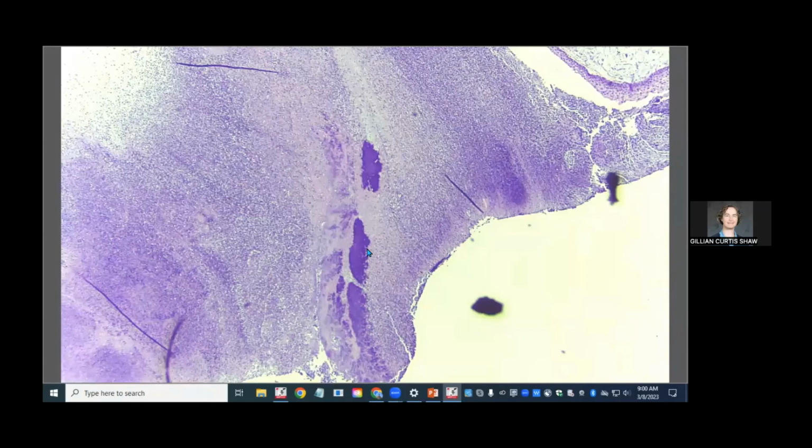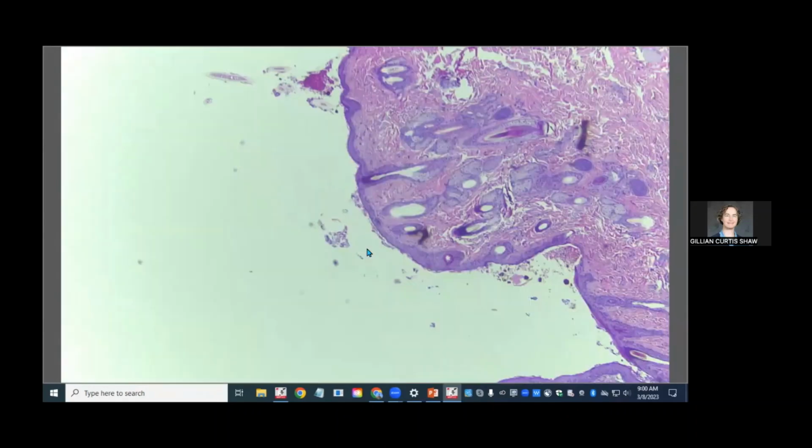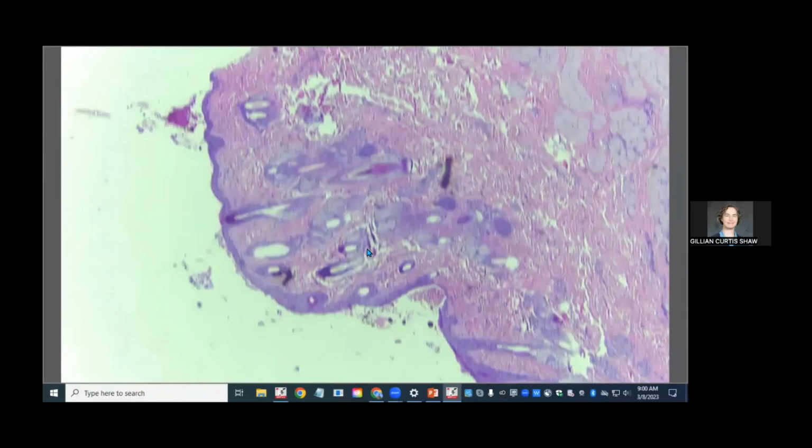So I'm going to show you. If you have to go home, that's okay, but I'm going to show you what was going on in the eyelid of the other eye. Got oceans, you got pearls. It's a fun day. Is it beautiful?